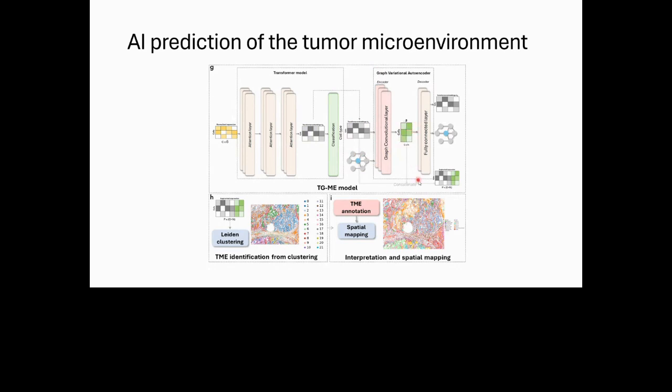And these embeddings, we're going to be extracting them. Our graph variational autoencoder is going to be trained to reconstruct these two matrices. But again, what we care about is the embeddings. After we get those embeddings, we're going to put them together, the attention scores from the transformer and the embeddings generated from the graph variational autoencoder, and we're going to pass them through clustering.